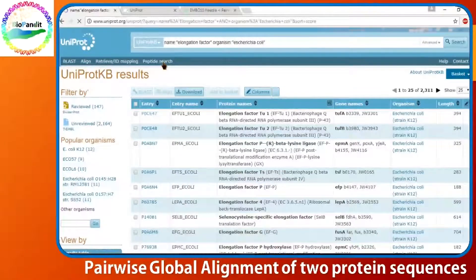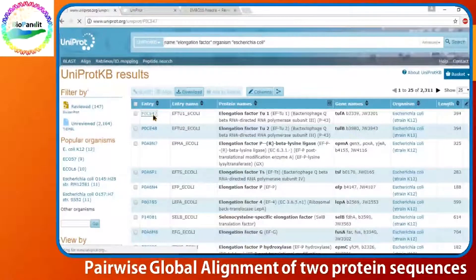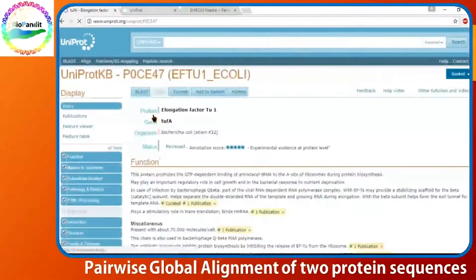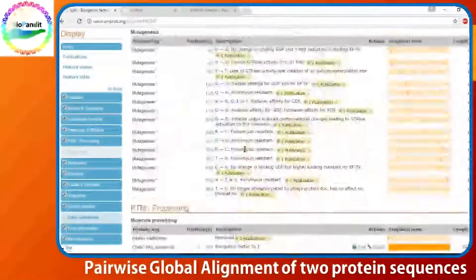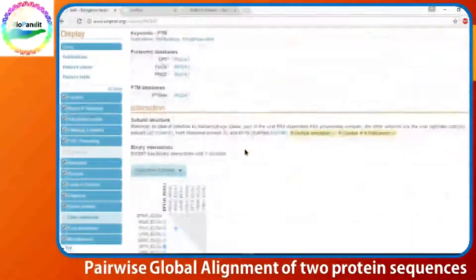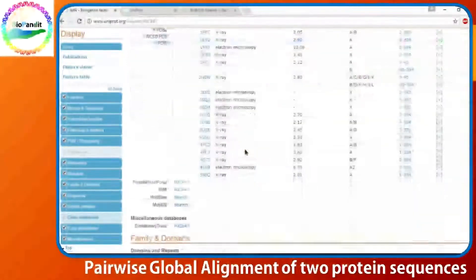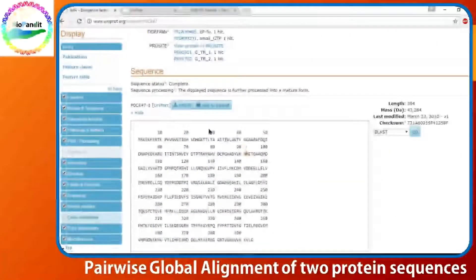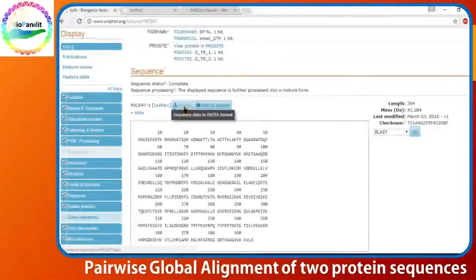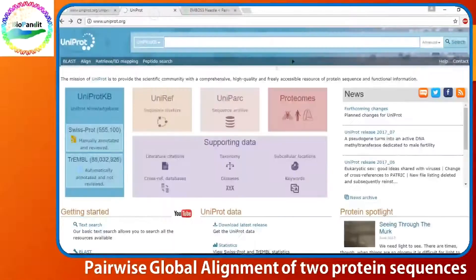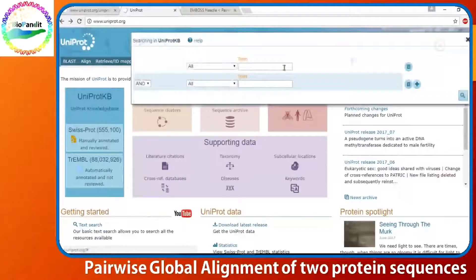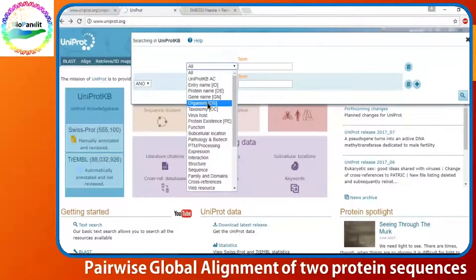Select any one and go to the entry page. Let us scroll down — this is how you download the sequence in FASTA format. Now let me perform the same operation for Thermus thermophilus.